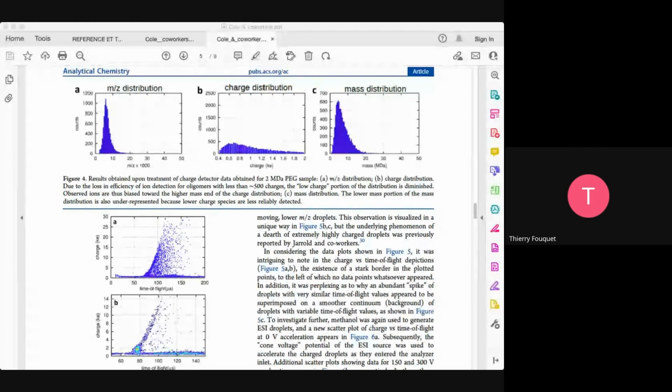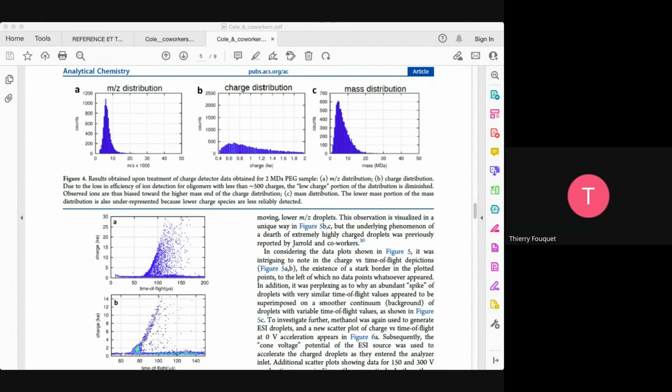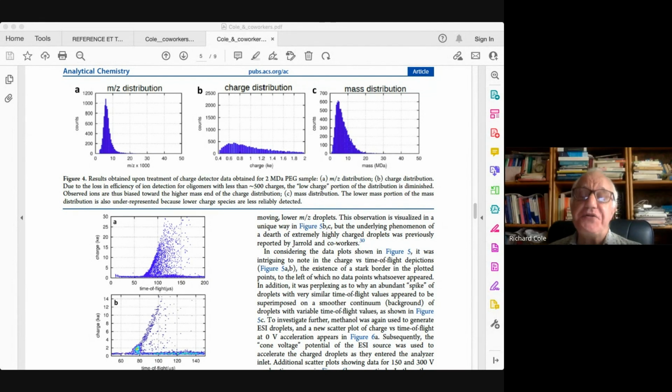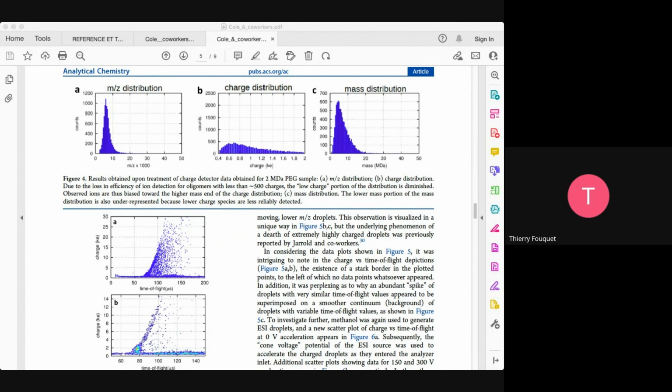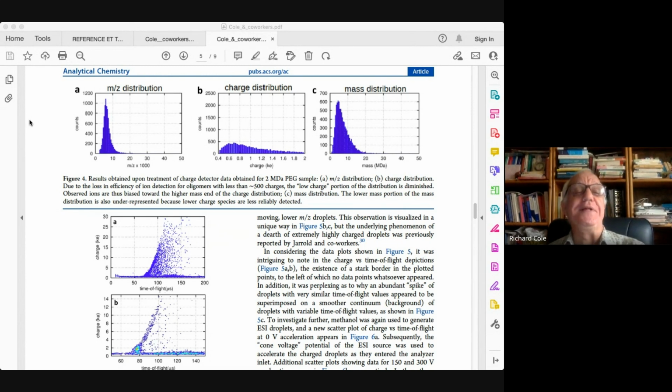Would that be possible? Well, I'd say that since we have a non-destructive analysis, it is possible to do further experiments as species exit the tube. But our instrument is not yet set up to do that, I'll put it that way.